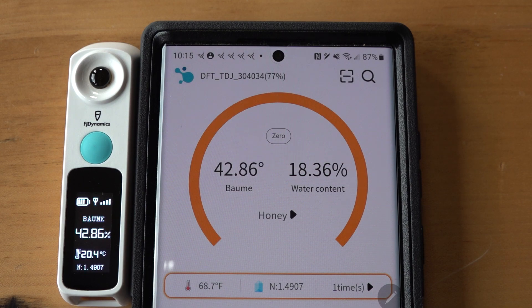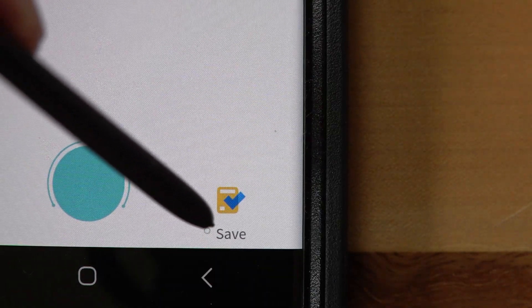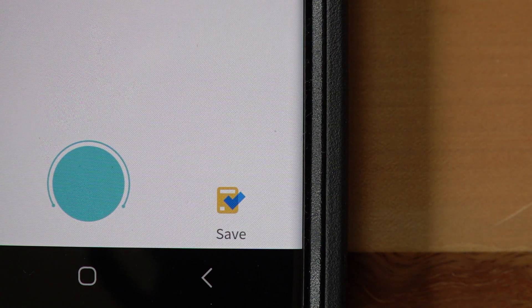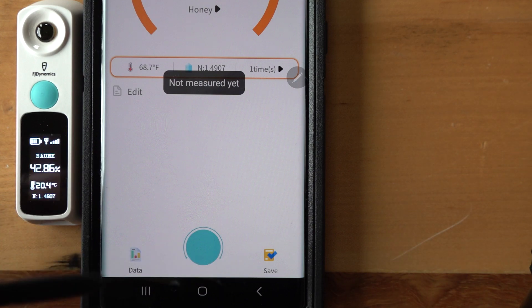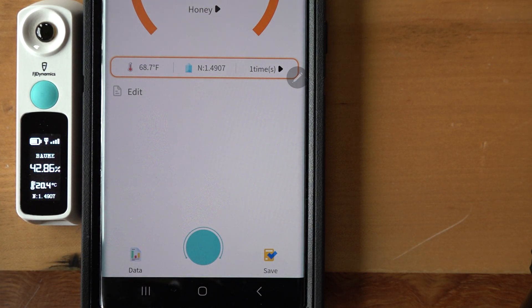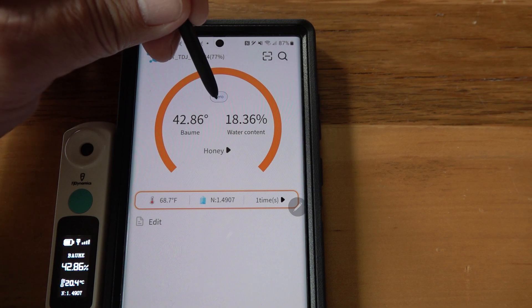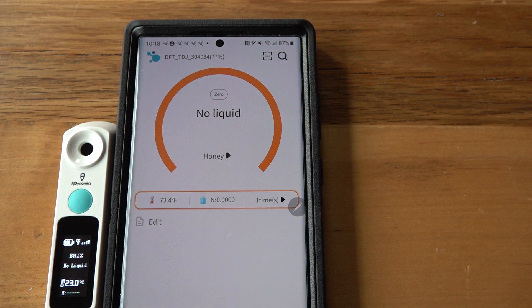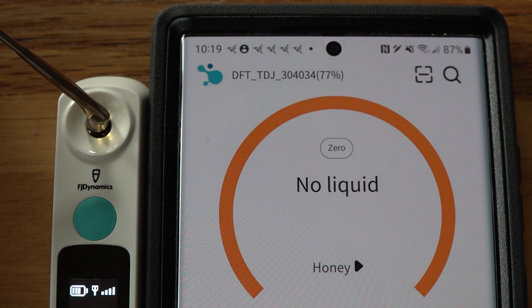I'm not very excited about that result. The temperature is now reading 68.7 degrees Fahrenheit — it's been jumping all over the place. We're still connected at least, and the battery is at 77%. When I try to save the data it says 'I don't have any data to save' and 'not measured yet' — even though it just gave me the water percentage and was still connected to the unit. So I'm zeroing it out again and re-calibrating before putting honey on it one more time.